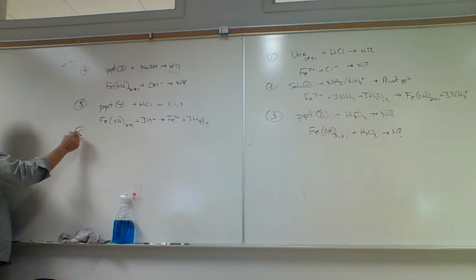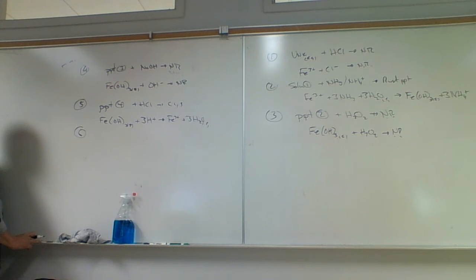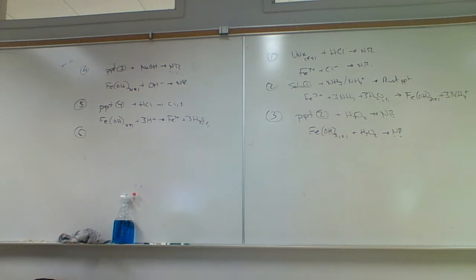Okay, then what's the next step? Step 6, what do we add? What do we add in step 6? Keith, what did you add?